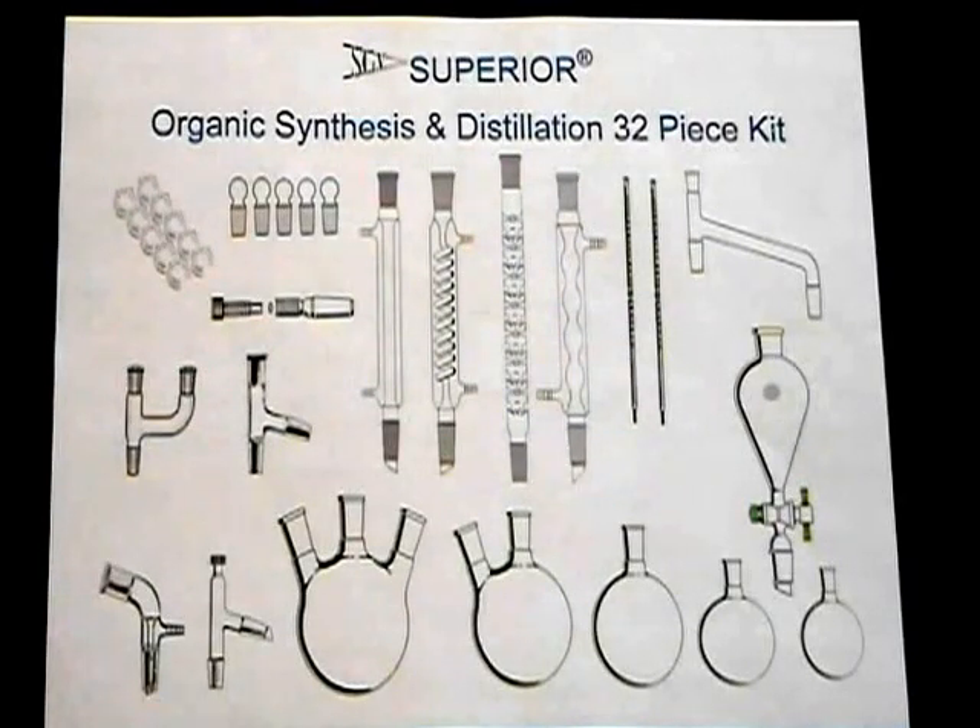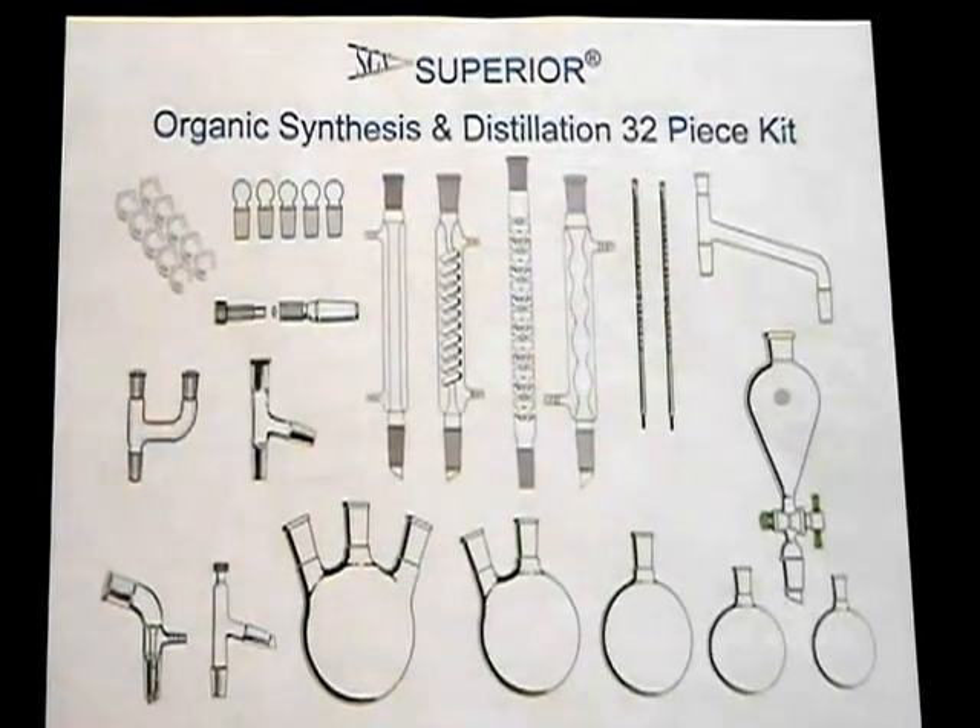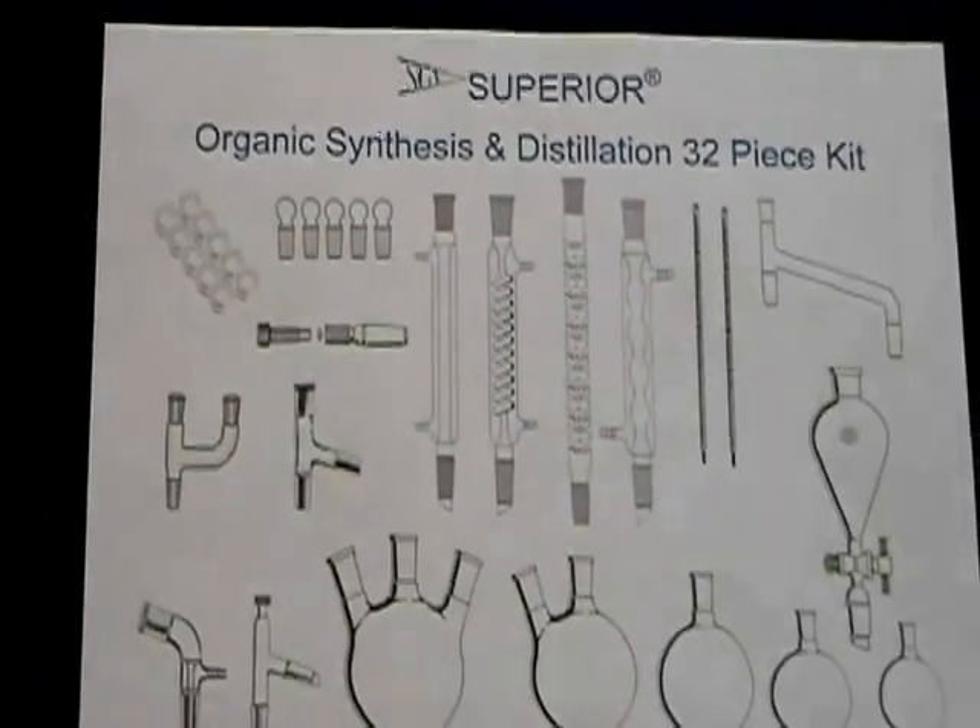We are very pleased to offer this Superior Series Advanced Organic Chemistry Lab glassware kit for organic synthesis, distillation, separation, and other organic chemistry preparations. All glassware in this kit is made from low-expansion borosilicate glass, and all joints are 24/40. These kits are manufactured in our ISO 9001 qualified factories and meet the strict ASTM quality requirements. This kit comes complete with the following.